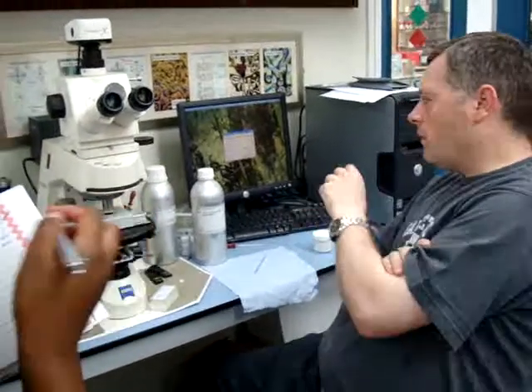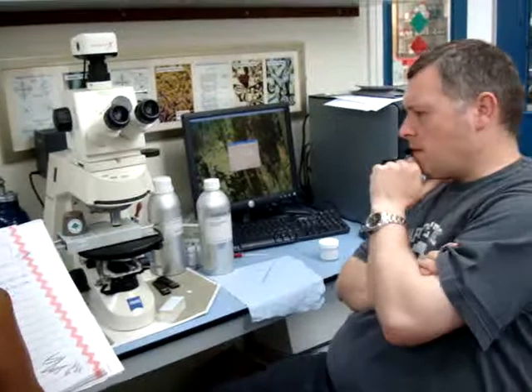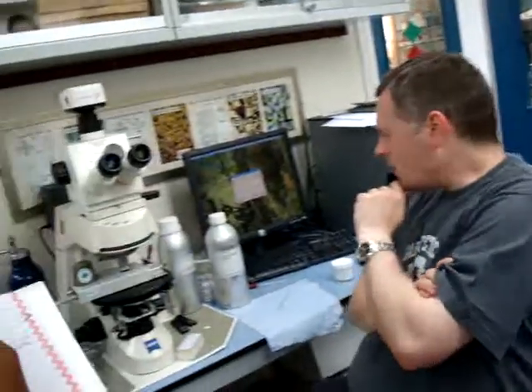So this is at the point just about how many degrees after it melts? Right, okay, well this is 5CB, and 5CB melts in the low 20s. Oh, geez. So it's a room temperature liquid crystal.